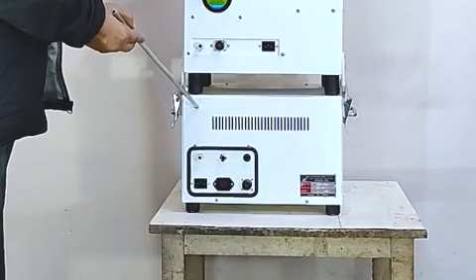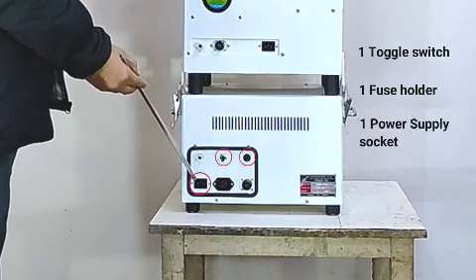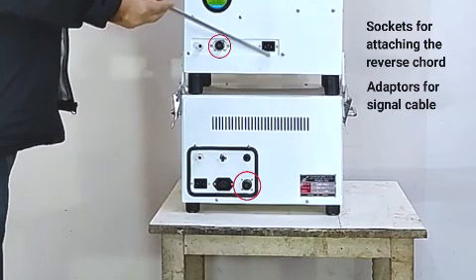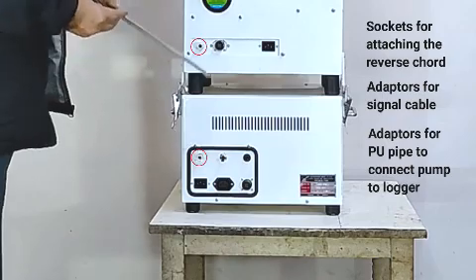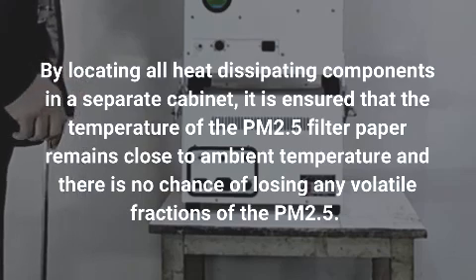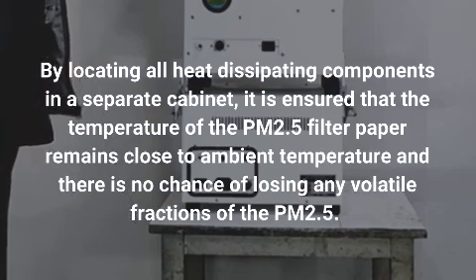There is a separate pump cabinet having one toggle switch, one fuse holder and one power supply socket to provide power supply to the instrument. It also has sockets for attaching the reverse cord, adapters for the signal cable, and adapters for the PU pipe to connect the pump to the logger. By locating all heat dissipating components in a separate cabinet, it is ensured that the temperature of the PM2.5 filter paper remains close to ambient temperature and there is no chance of losing any volatile fractions of the PM2.5.